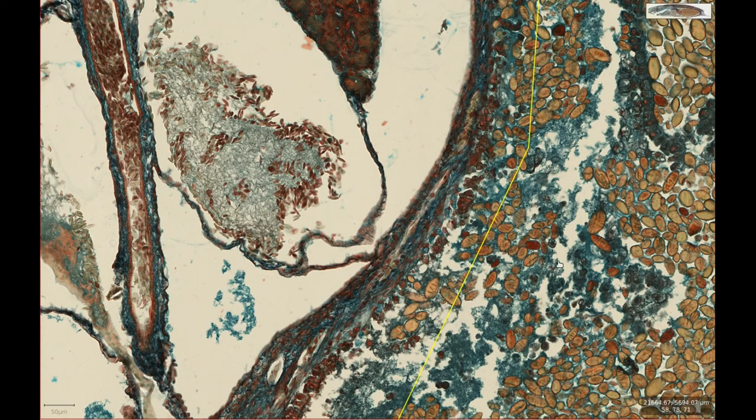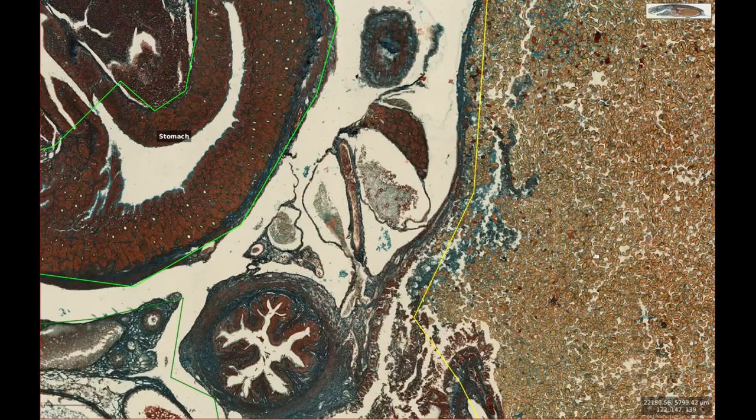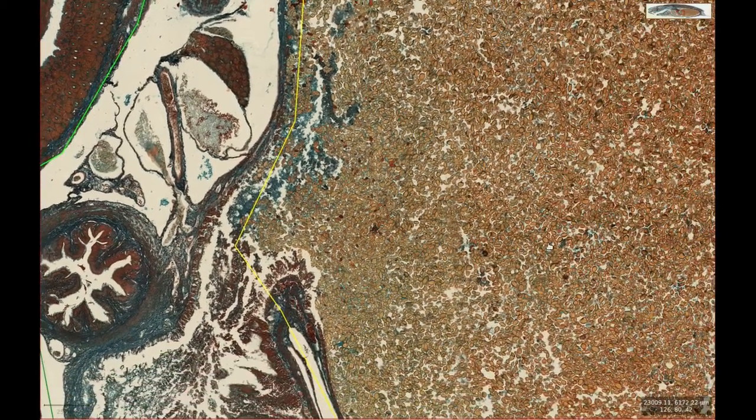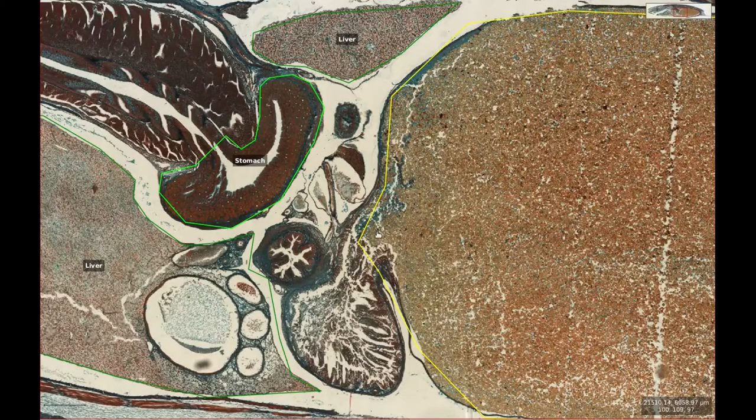The globules are much bigger with a variety of different sizes and shapes. Actually, these globules are made up of yolk, and the large structure containing them is the yolk sac, which feeds the dogfish during development much like the yolk of a bird's egg. In this section we can even see the connection between the yolk sac and the intestines.